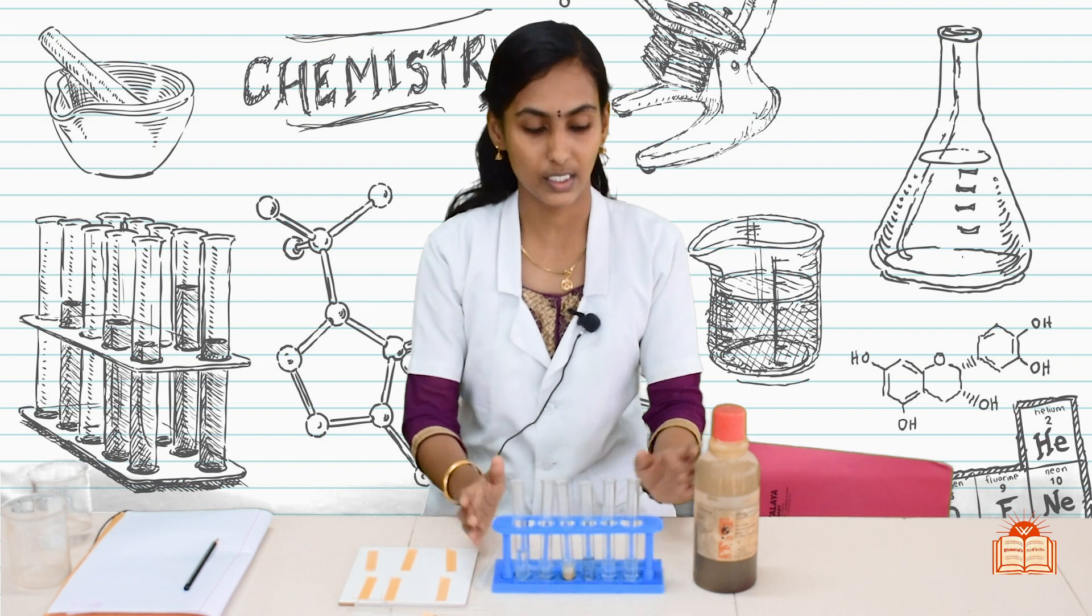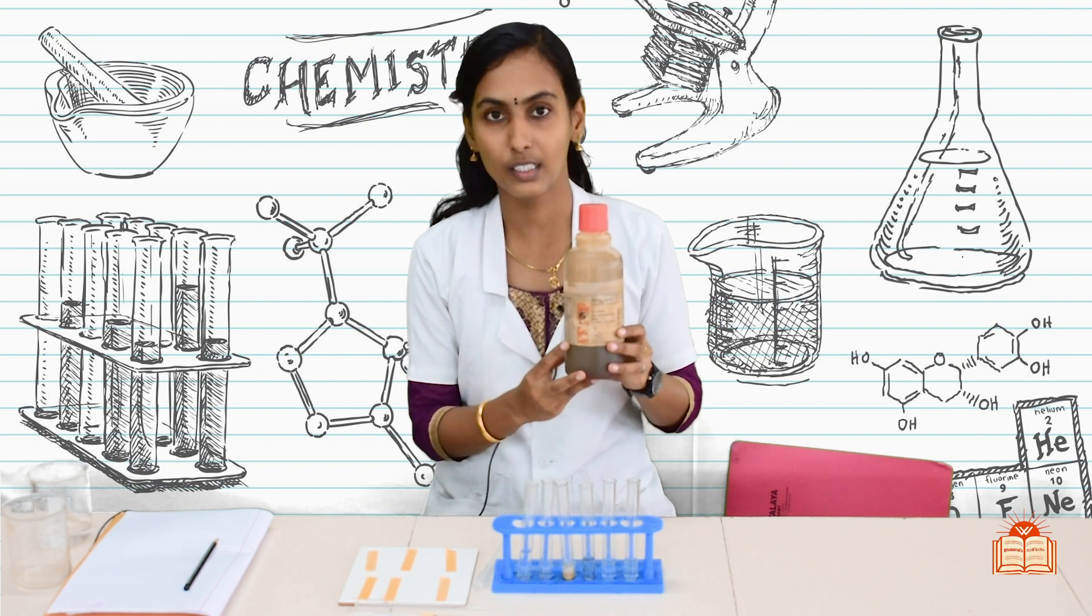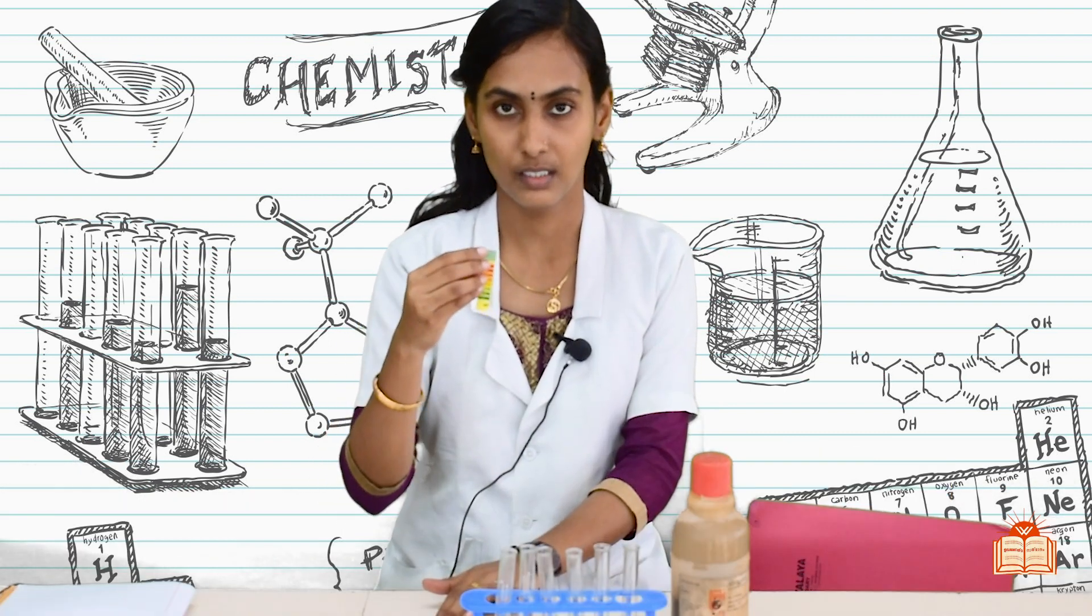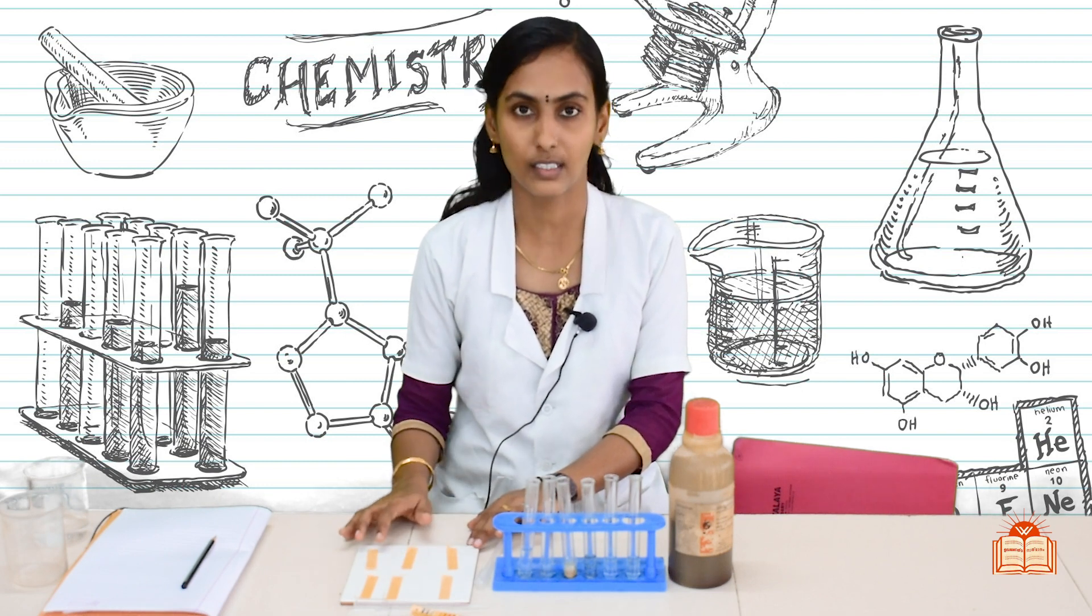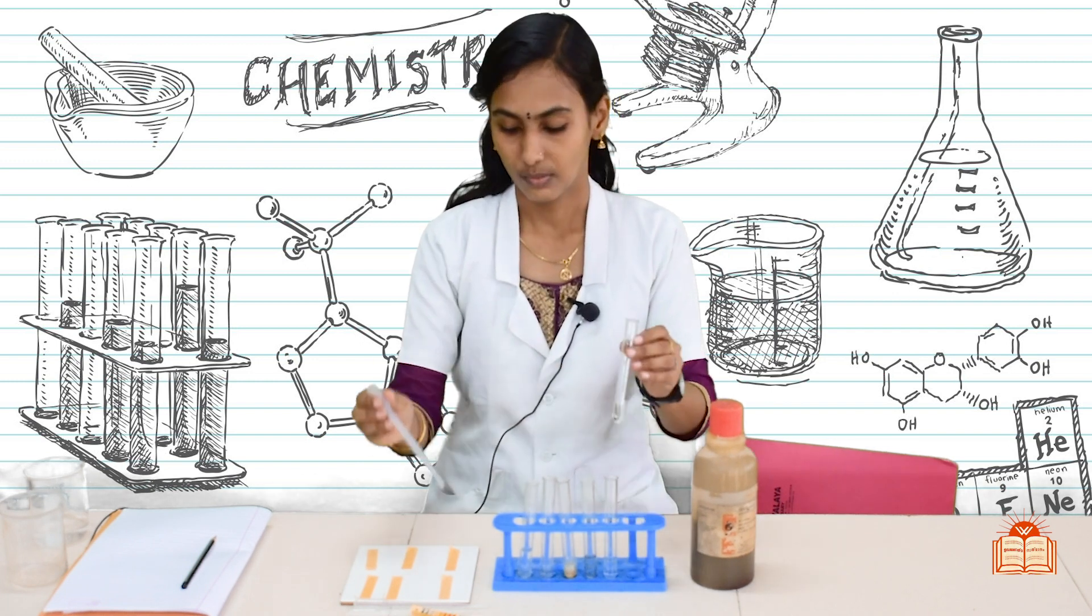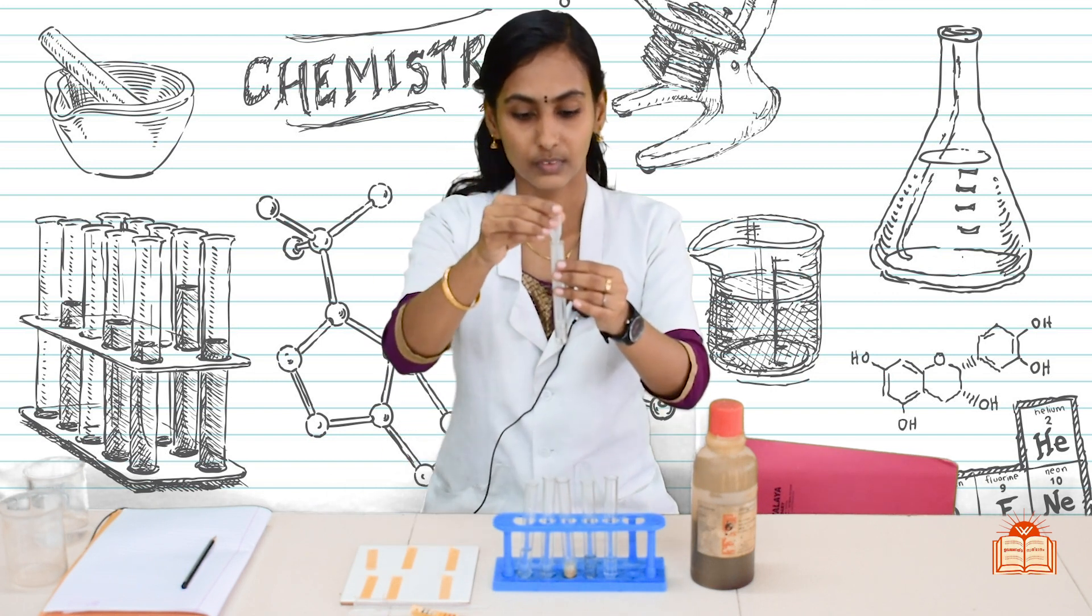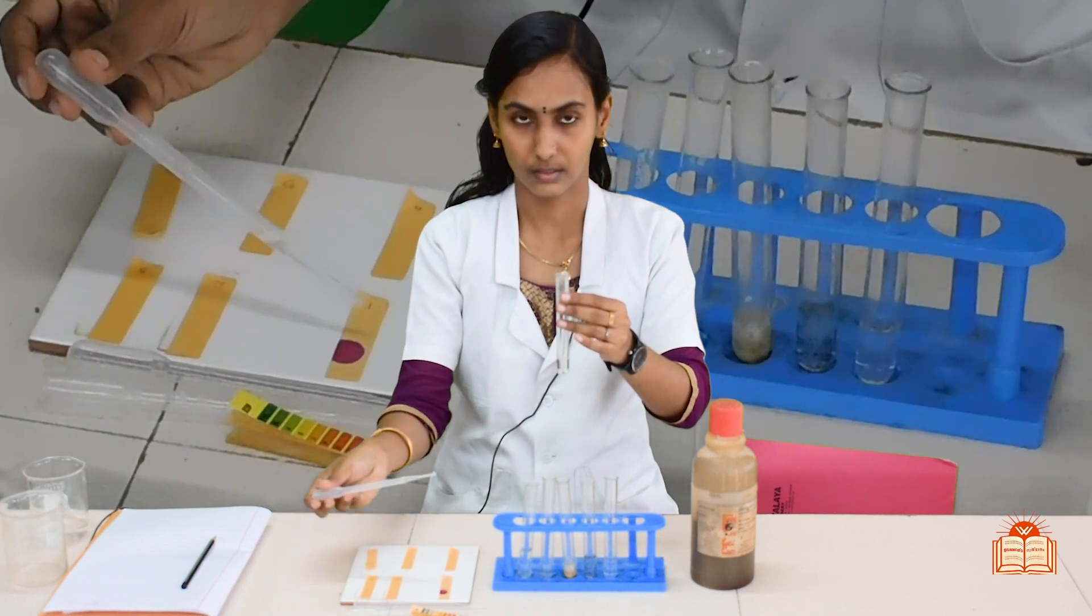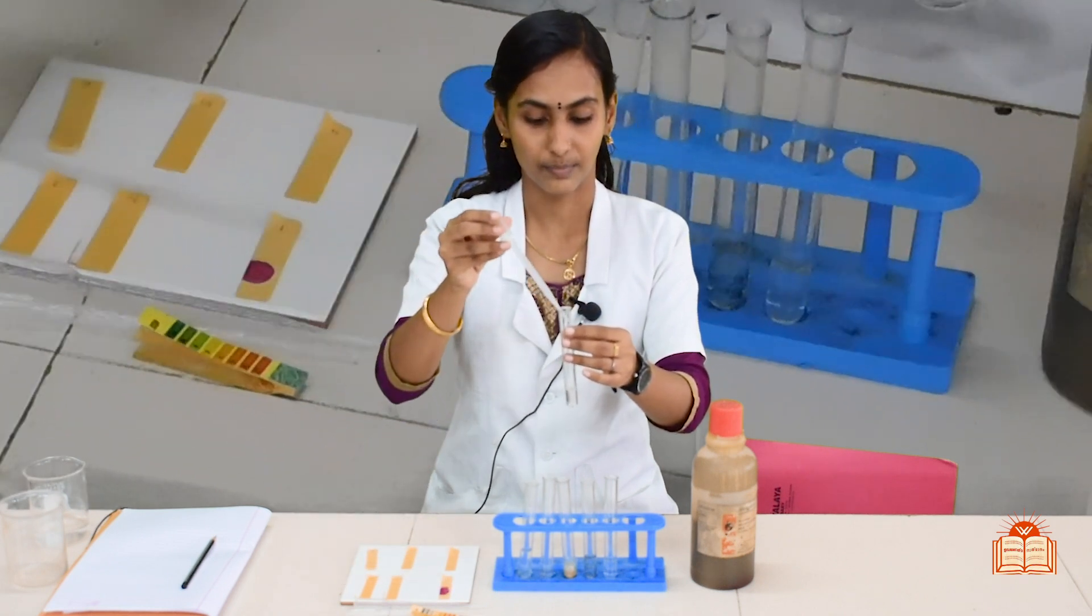Here we have pH paper which will be used to identify the nature of the substances. Six strips of paper are taken and marked as 1, 2, 3, 4, 5, 6. Now using this dropper, we will add the solution one by one to the pH paper. Let us see, first one, dilute HCl solution, add some drops to the pH paper. Can you see the color? It turns to dark pink color.